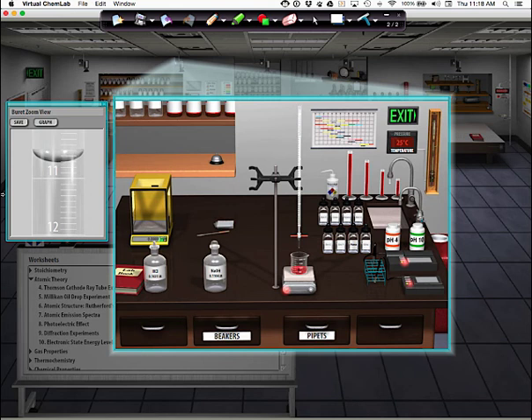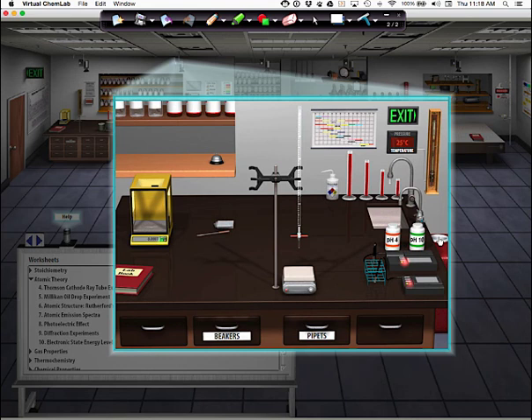And you're going, seriously? Yeah, watch how fast this goes, guys. Right here is the trash. All that you have to do is this. Click on the trash can and it throws everything out. Then all you've got to do is set this up one more time. And guys, look at how fast this goes.